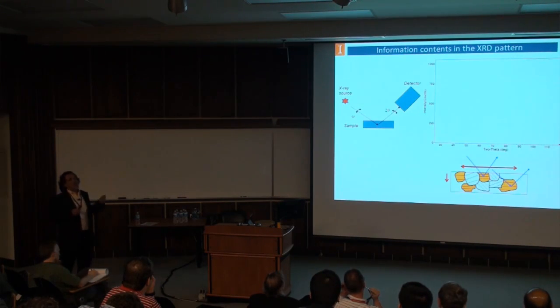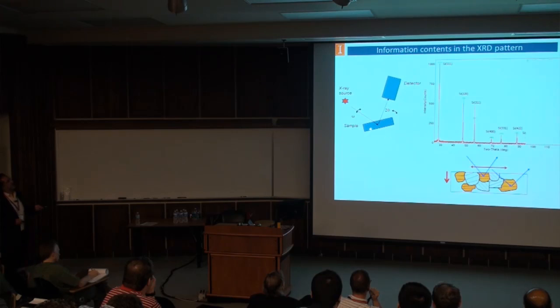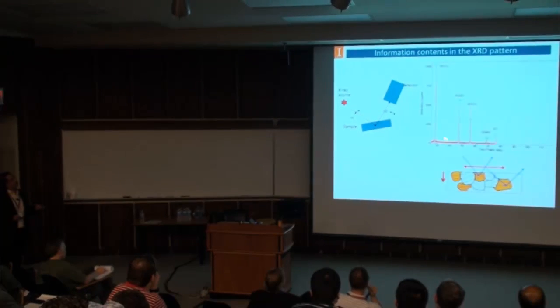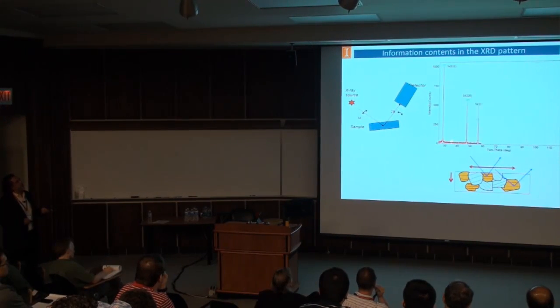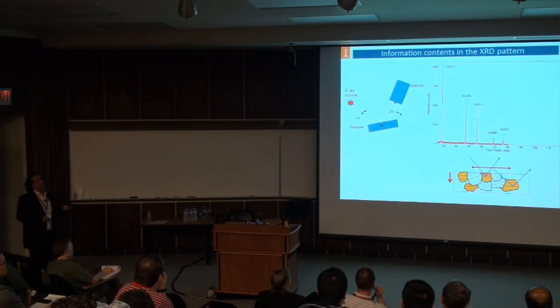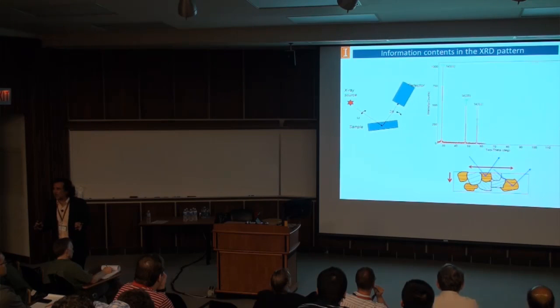So now in a basic X-ray measurement, again, let's go back to our 2 theta omega scan. As you're scanning, the sample is changing, the detector is changing. You go from low to high angles, for example, and at any point where you see a peak, it is because you have hit a set of planes in the crystal where you have a periodicity. Now, this picture is also very important to understand artifacts.